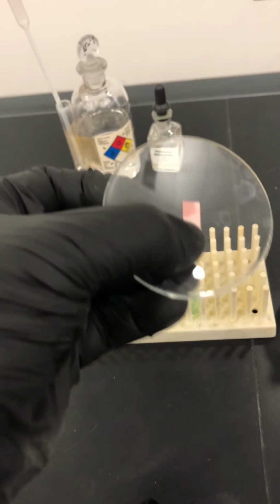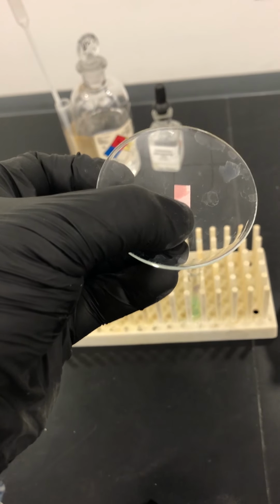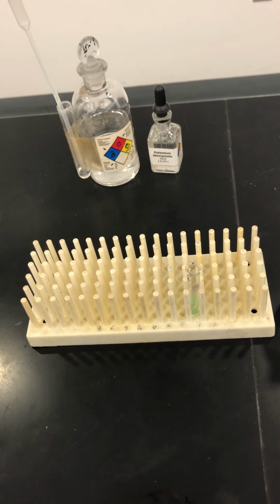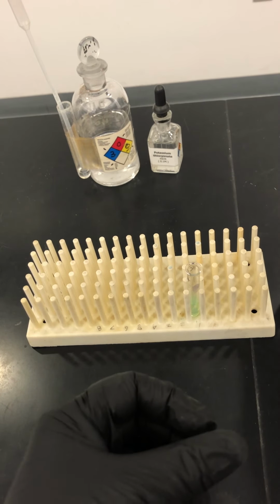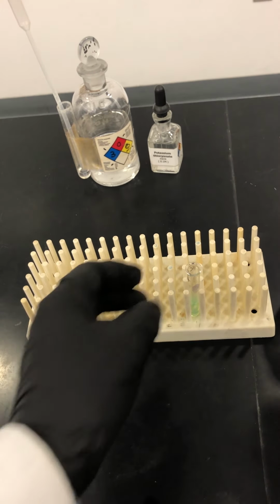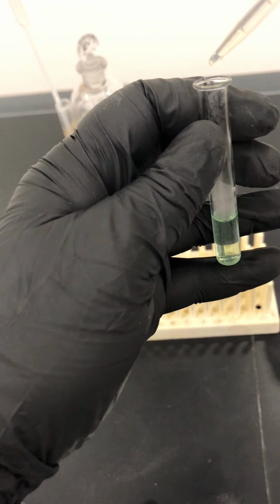As you can see, the litmus paper is getting wet, but it's not changing color. That means that my sample is still not basic enough, it doesn't have enough ammonia in it. So I'm going to keep adding drops until I get it to work. So here we go. There's more ammonia.